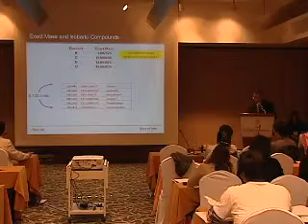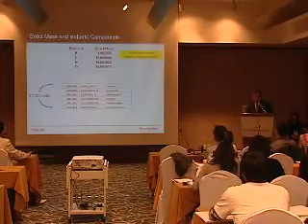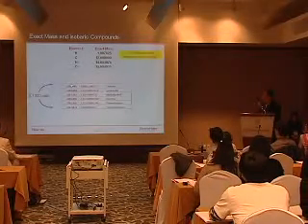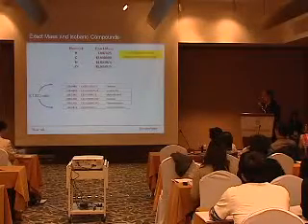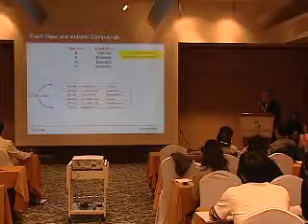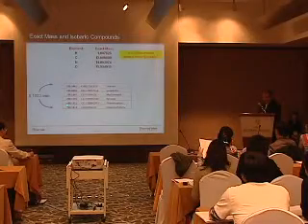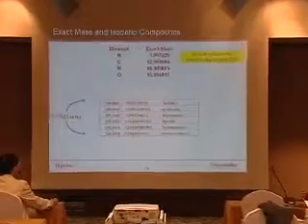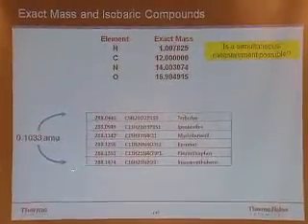First of all, let me take 6 pesticides that all have the same nominal mass. The same nominal mass means they all have a molecular weight of 288 point something. These are all 6 pesticides over here, and there is their calculated true molecular weight. Now, if you have a quadrupole mass spectrometer or an MSMS mass spec, or a time of flight, you cannot tell the difference between those different pesticides.